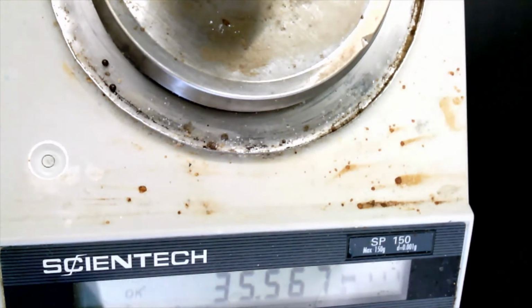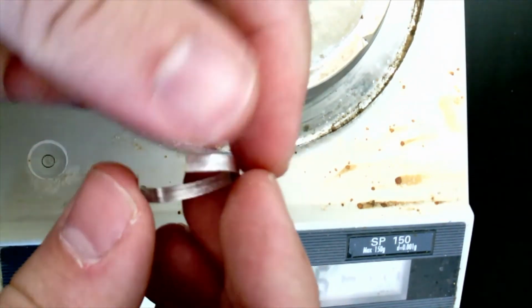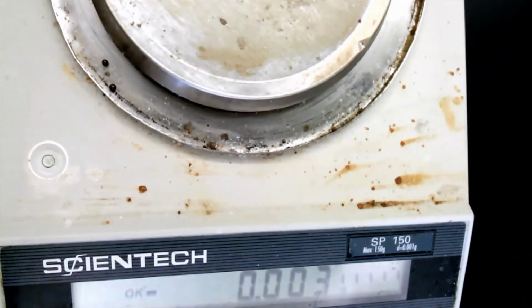So I'm going to polish my magnesium one last time. Get it really nice and shiny and reactive. And I'm going to coil it loosely. It tends to just work better when it's coiled loosely for whatever reason. And I'm going to toss that in there. Get it on the bottom here, nice and flush with the bottom, so it will react quickly.